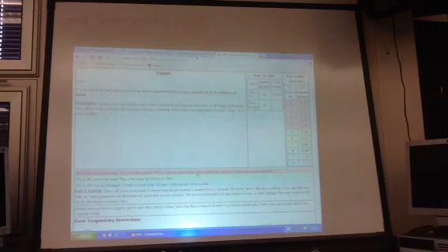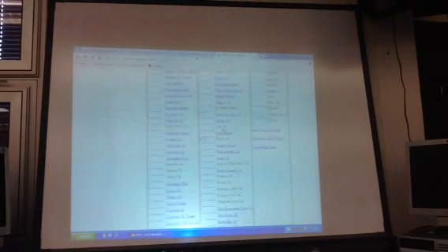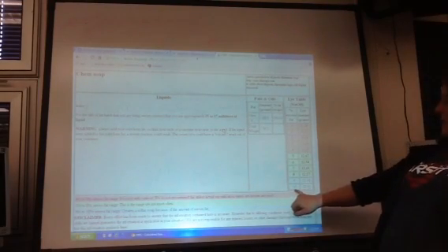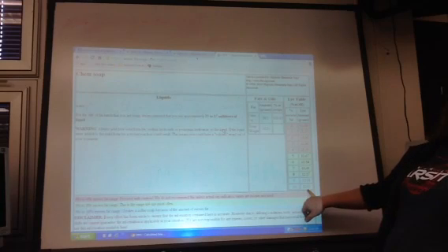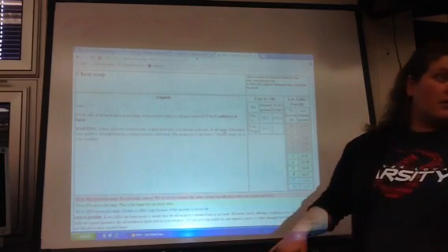Now, I played around with this a little bit earlier and changed numbers until I tried 98.5 grams of olive oil. That gives us a requirement to have 10% excess. We would have 12.01 grams of sodium hydroxide. That's pretty good. So I think our calculations are very good.